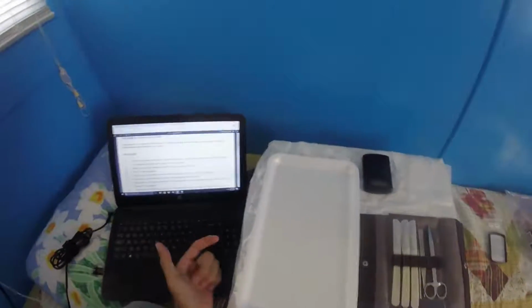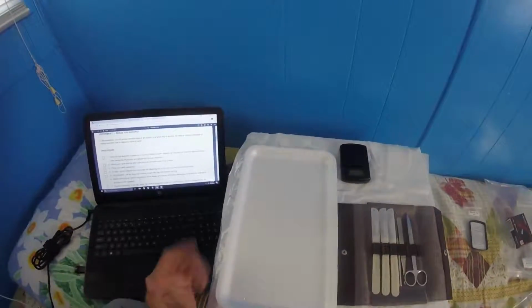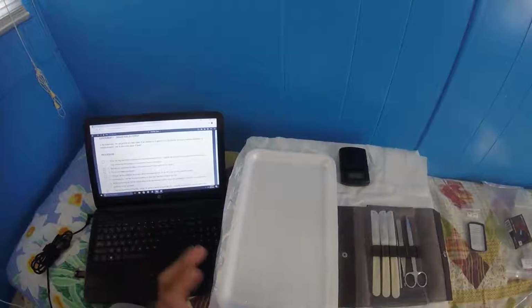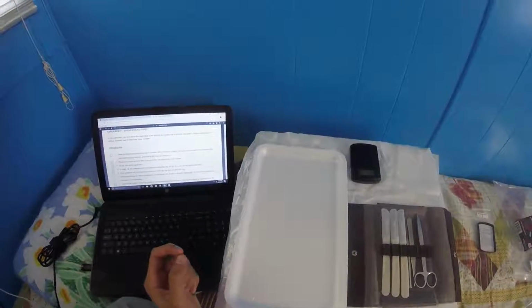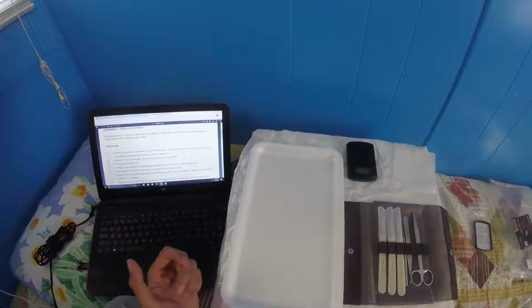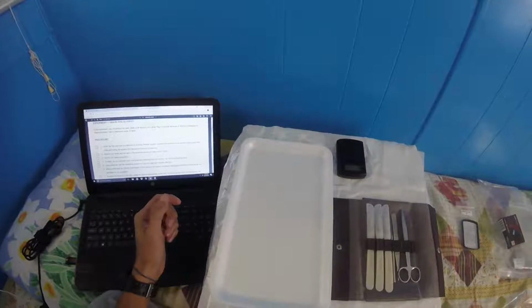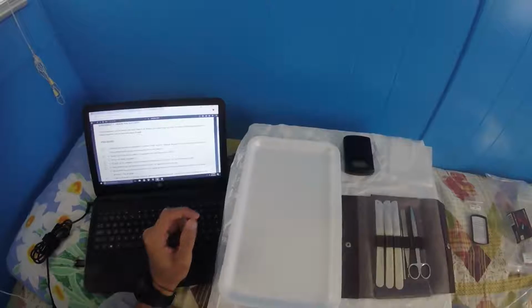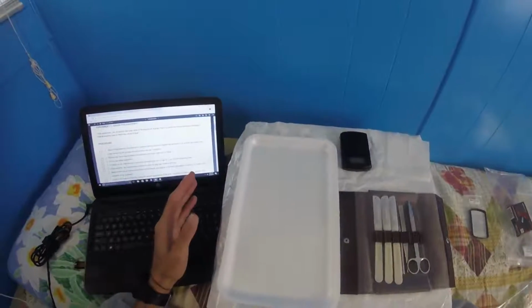Okay, so week 10, experiment 1 is the grass frog autopsy. In this experiment, you will perform the basic steps of an autopsy on a grass frog to practice the steps a forensic pathologist or medical examiner uses to determine the cause of death. While the frog specimen is preserved in a Carolina Perfect solution, imagine the specimen as a recently discovered body when performing the autopsy and answering post-lab questions.